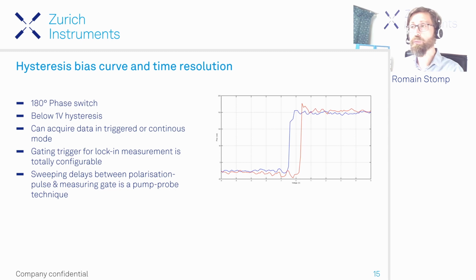and that is, of course, all totally configurable. So we've shown you this basically on one point on the surface, on a PZT, for rather simple scales. But now, of course, the next step would be that you can play with the width, with the delay, with the dwell time, and all these things.